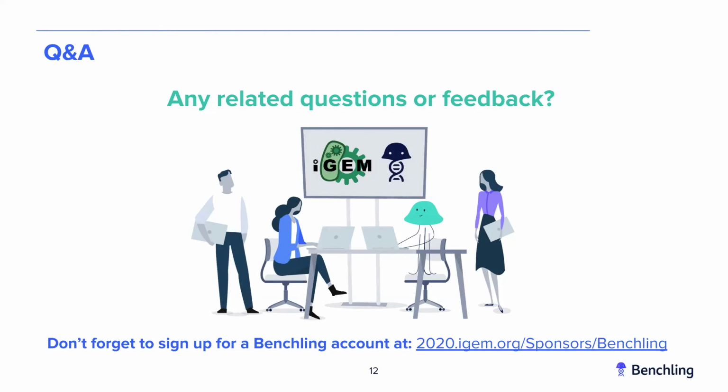Hopefully that answers your question, but we do have a whole CRISPR section in our help center. So if you want to look at that in depth, we're happy to answer additional questions if you have them. And you can also do gene knockouts or knock-ins.